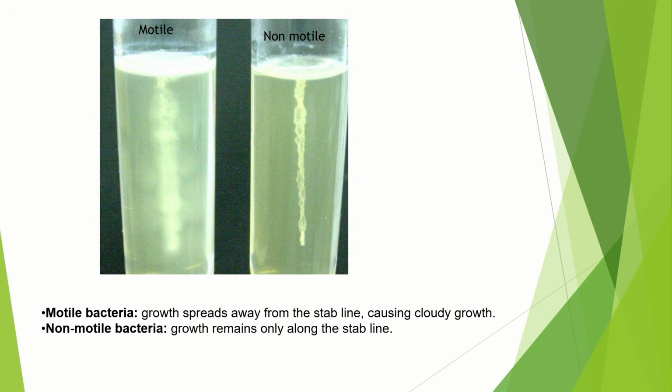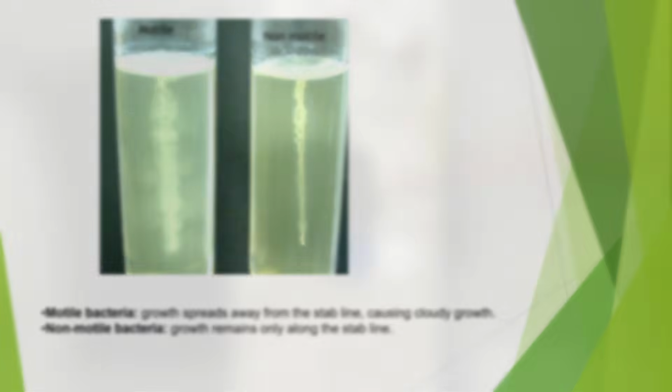Now let's get into our demonstration of this test.